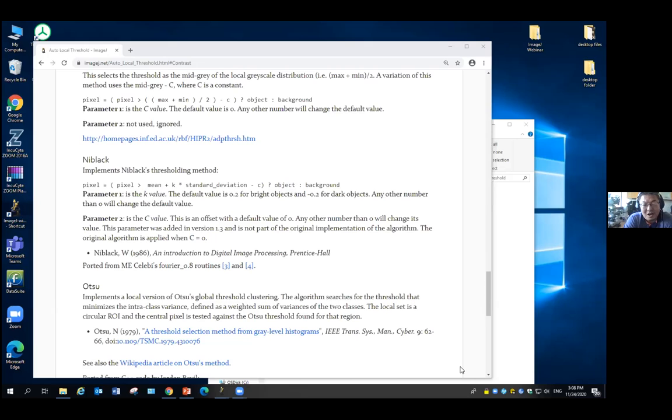All the effort is to make a good mask, but the most important thing is that our effort is consistent on all the images. On every single incoming image, we have to go through the same process.